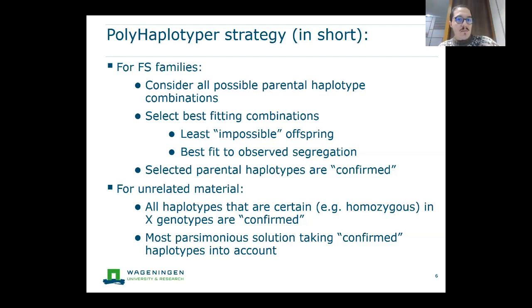Of course, the one with many more combinations will take much longer to estimate. And that means that in the end, the haplotyping can take very long, just because there's a few haploblocks that require a lot of time to compute. So there is a parameter you can set to discard any haploblock that has more than X number of possibilities, and that can reduce the time that you need to haplotype.